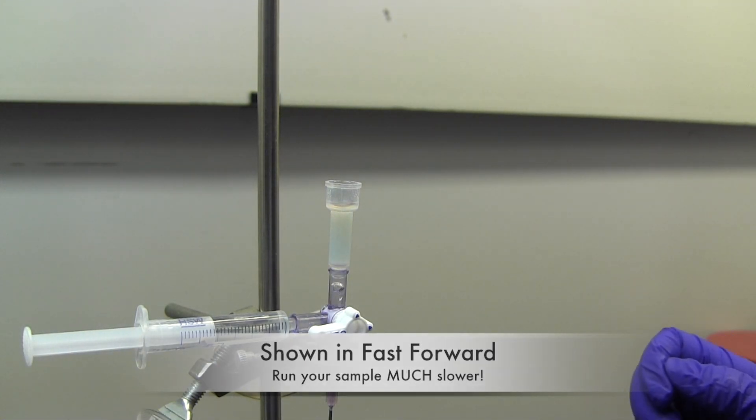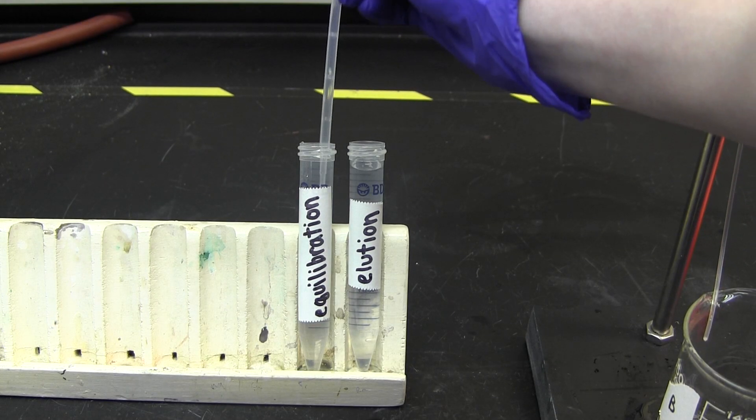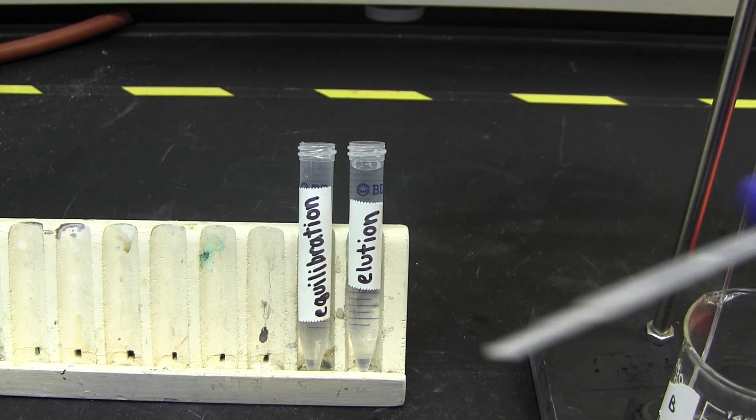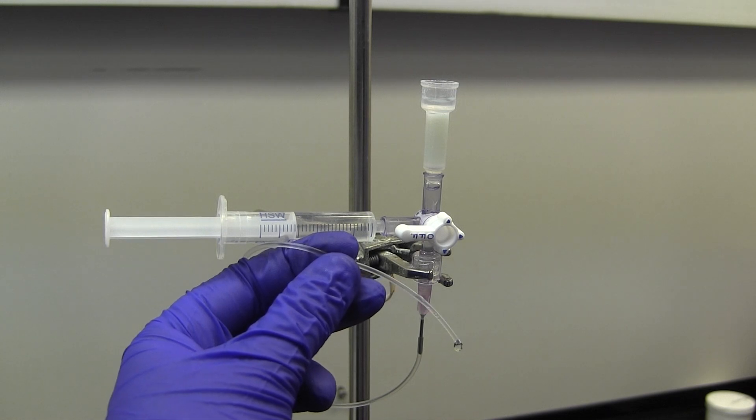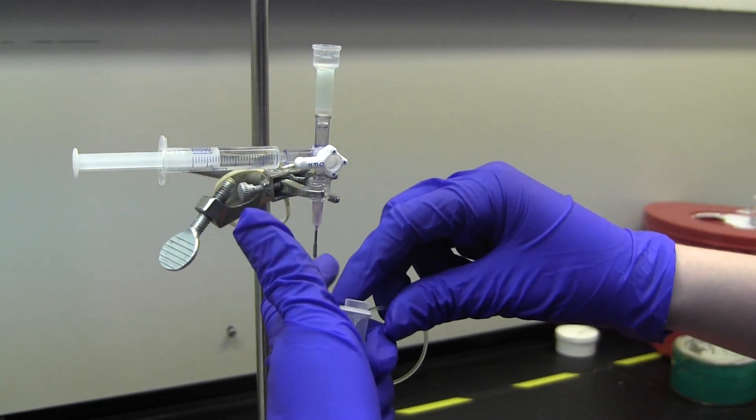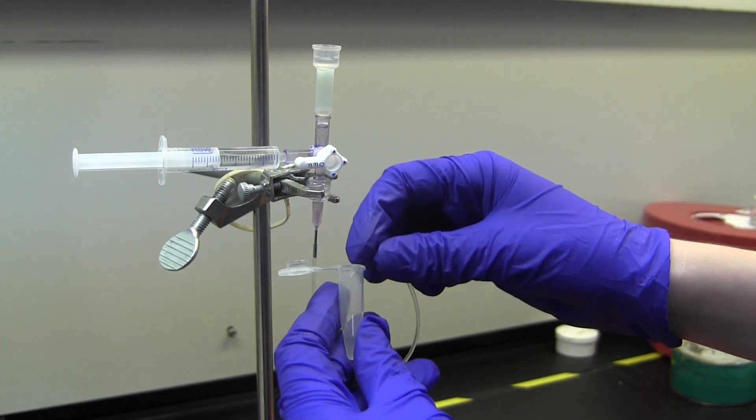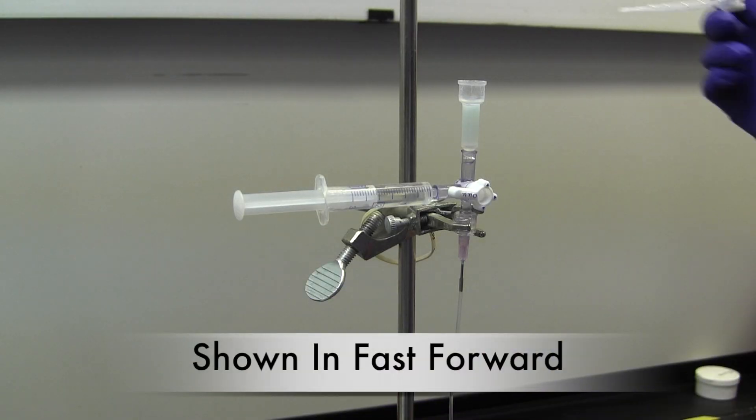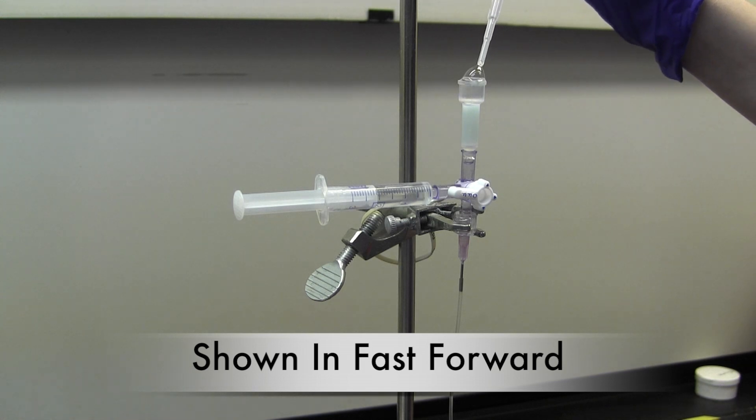Then, wash the column with 0.25 milliliters of equilibration wash. Collect this and discard the fraction. Wash the column with 0.5 milliliters of equilibration solution again. Collect this into a 1.5 milliliter bullet tube. Bullet tubes can be obtained from your TA or instructor. Next, wash the column with 5 milliliters of the equilibration wash and discard.